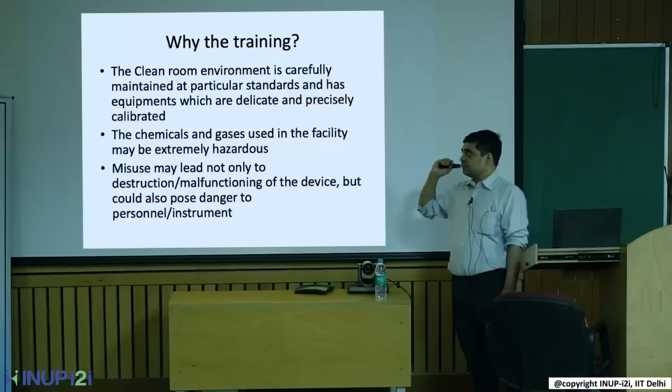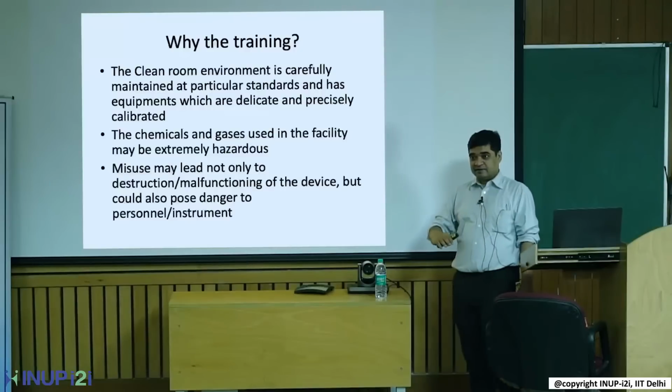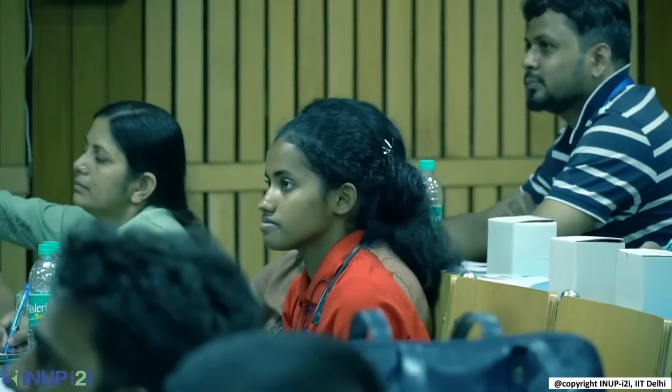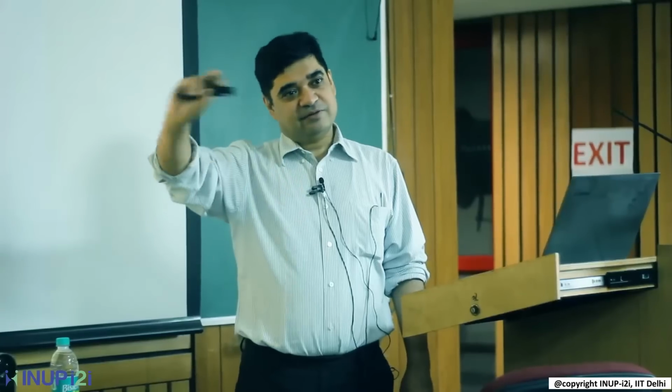So maintaining clean room quality is a shared activity. Everybody has to follow, otherwise everybody's devices will get affected. So that's why this user training, it's not just a matter of my devices. One user affects all the users. So all users have to be trained and follow.